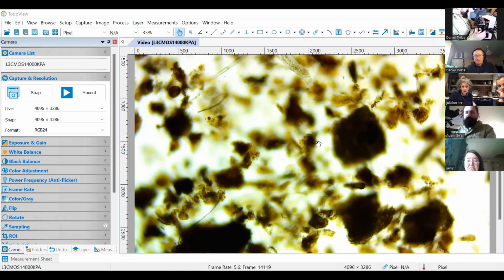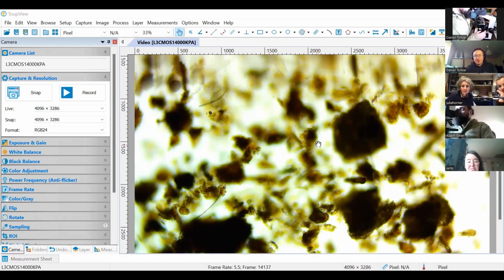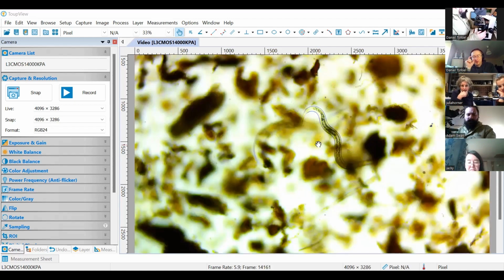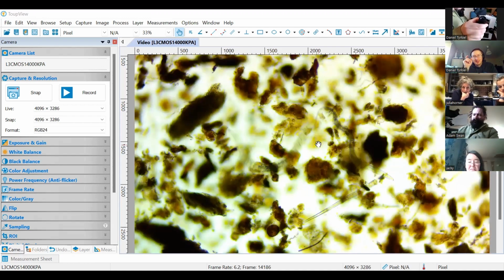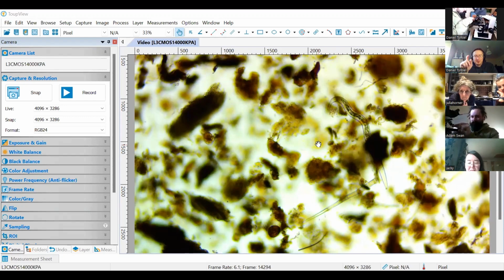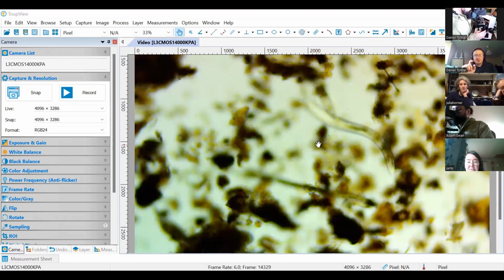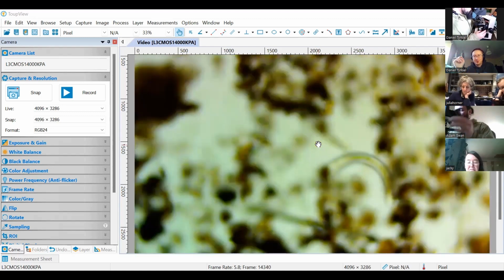So when Adam speaks about magnification rates, if you look at the microscope, you've got the ocular here, the things that you look through, and then you've got the objective. And the ocular usually is 10 times magnification. So that's what Adam's showing on the other one. And then the objective basically is what you can change, and the ocular times the objective is your total magnification. So this is 100 times total magnification: 10 times in the ocular, and 10 times in the objective. 10 times 10, 100.